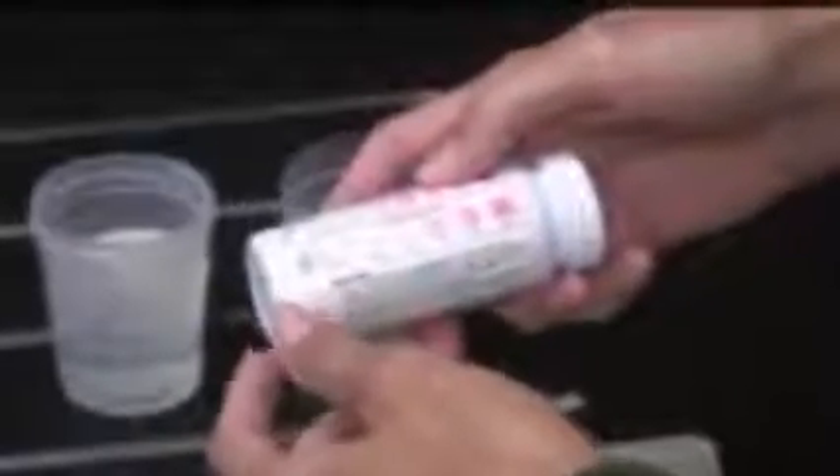At somewhere between 60 and 120 seconds — so a minute to two minutes — read the top strip, which is the nitrate measurement. It turns out that the full intensity of the color is the closest in correlation to actual lab results.